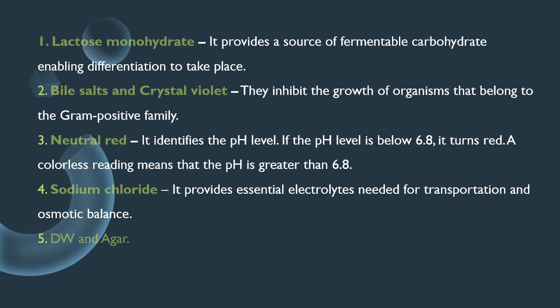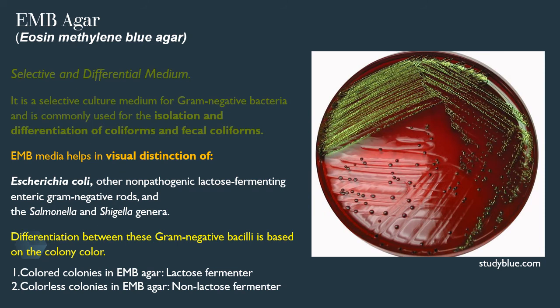Then next is sodium chloride. It provides essential electrolytes, which are needed for transportation and osmotic balance. Okay, and last is distilled water, which works as a medium, and the agar. Agar is a solidifying agent, right? It is present in all media that we use for plating, to solidify our media. So that was about MacConkey's agar.